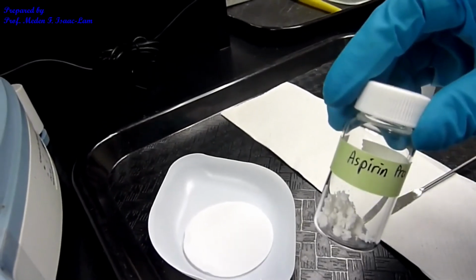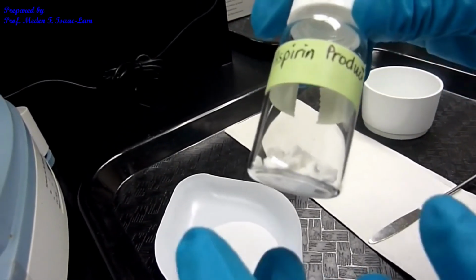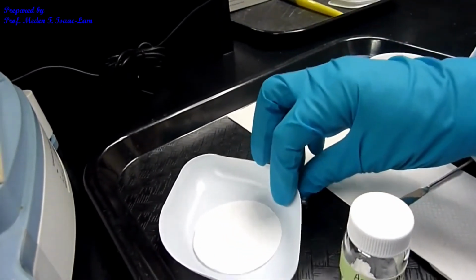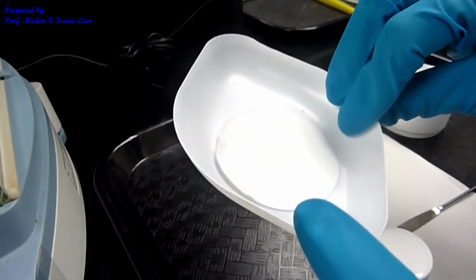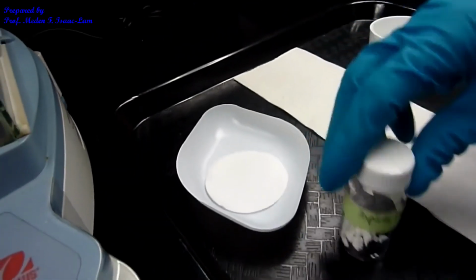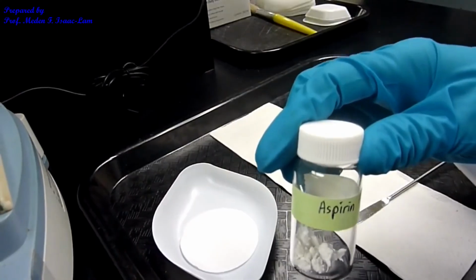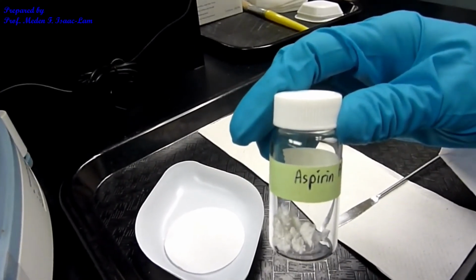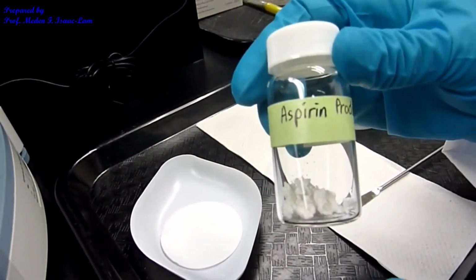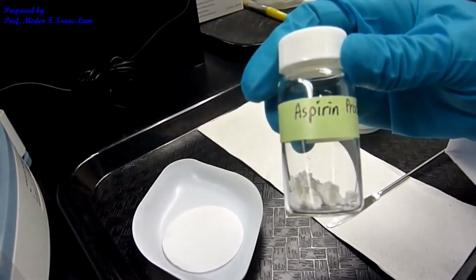To preserve the integrity of the sample, I will store it in a screw cap vial, and I also label it as aspirin product. And I took out everything from the filter paper and then from the weighing boat. So the product is now stored in a screw cap vial. For the next step, which is analysis, I will store it so that I don't expose it to oxidation in the air.